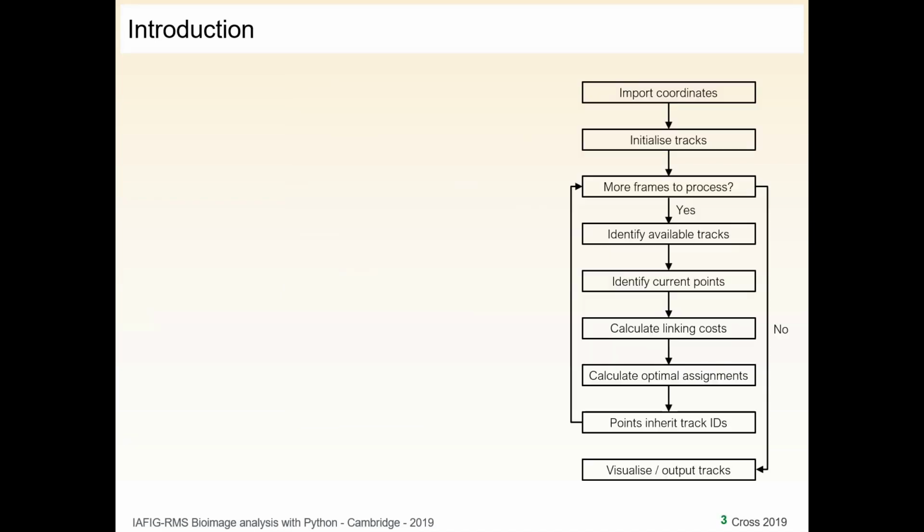Okay, so I'm just going to summarize the steps that we're going to be using today. This is simply an overview, and I'm going to be describing each of these in much more detail as and when we get to them. It's also worth noting that there are many ways to approach any analysis problem, and it could well be that the way we're going to work through this today isn't what you would have intuitively done yourself. This is fine, and once we've finished today, you can obviously go back and work through this, reconfigure the workflow in a way that makes more sense to you, and then compare the results, see whether you get the same kind of results using your own technique.